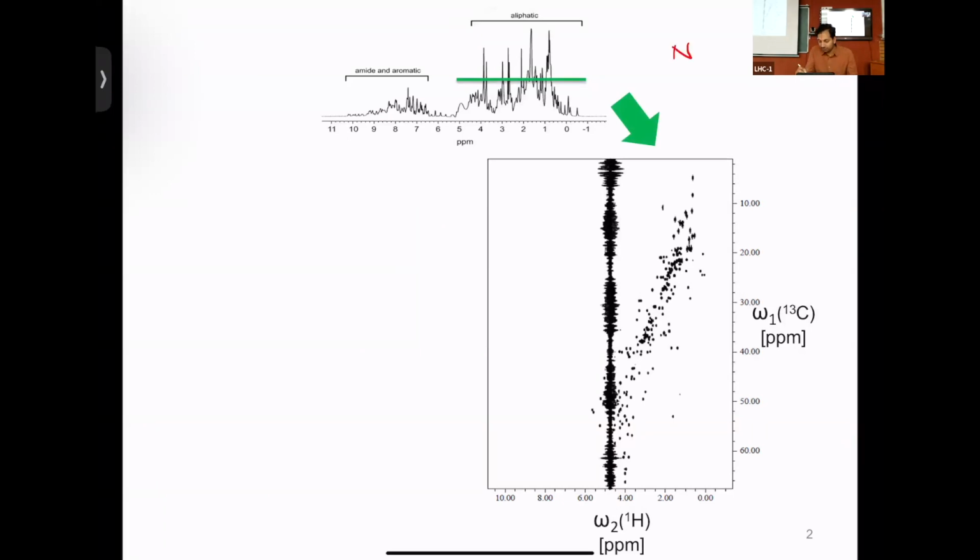The same structure that we just drew a moment earlier, let me draw again. I'm taking the example of a protein because that's commonly done. It's slightly easier to understand than nucleic acid. So I'm going to mostly restrict myself to proteins for these lectures, and we can change as we go. Previously, you were able to get the H alpha protons, aliphatic protons, somewhere in this range. And there are many aliphatic protons. If you go to the side chain, there is C beta, H beta, C gamma, H gammas, and so on and so forth. Everything bunches up there because all of them are aliphatic.